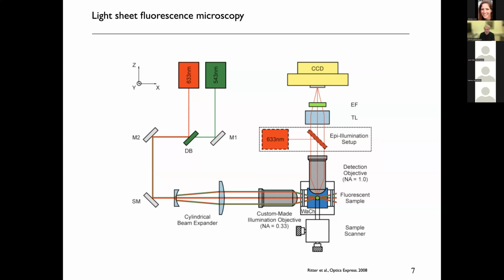That liquid can have different chemical features, but the key point is that then the detection is done perpendicular to the illumination direction and then achieved by a CCD camera. Usually we illuminate the sample, and while scanning the beam, as I showed before, along that illumination plane, we record one image with a CCD or nowadays with a scientific CMOS camera.